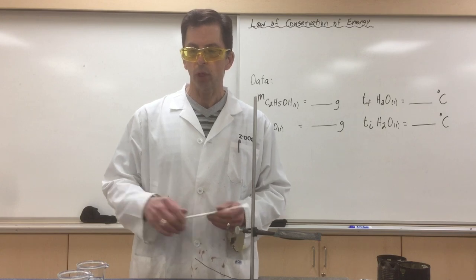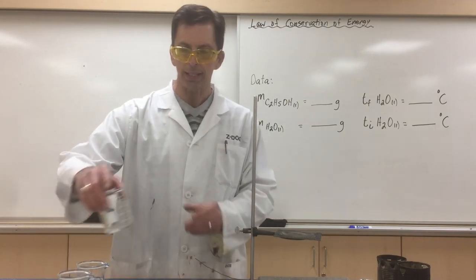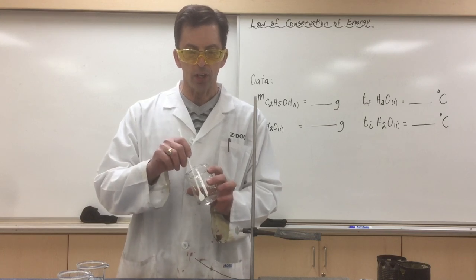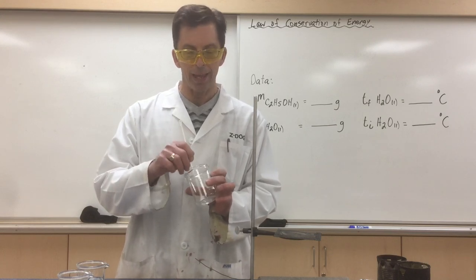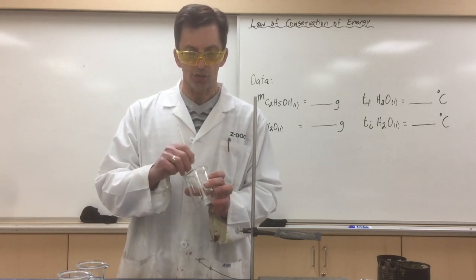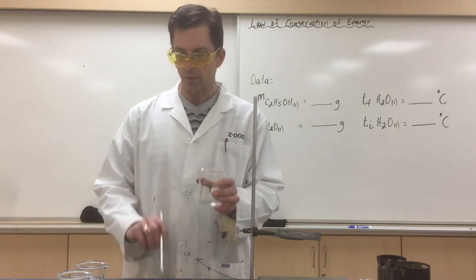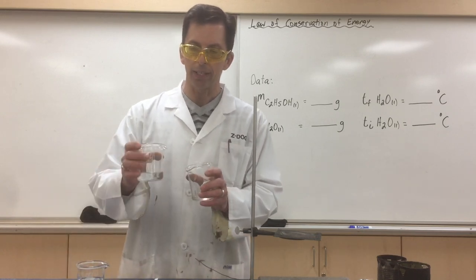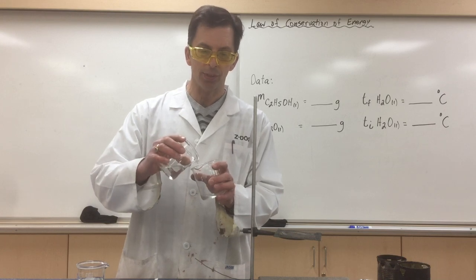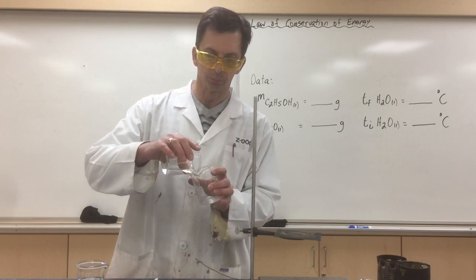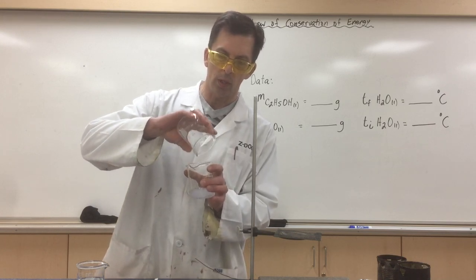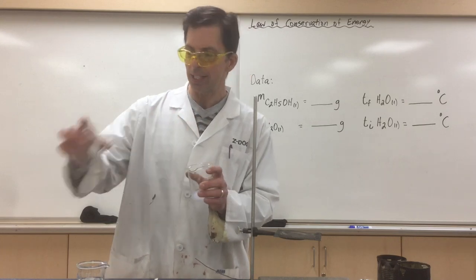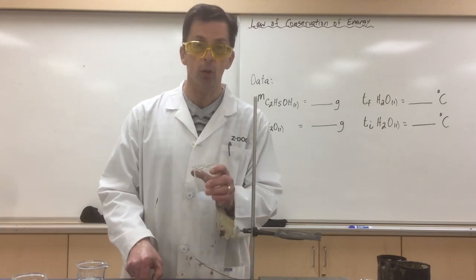The way we're going to do that is by creating a substrate. In this beaker we've got calcium acetate dissolved in water, so we've got a solution. To that we combine 40 grams of ethanol. Whoa! And right away you can see that a gel is being formed.